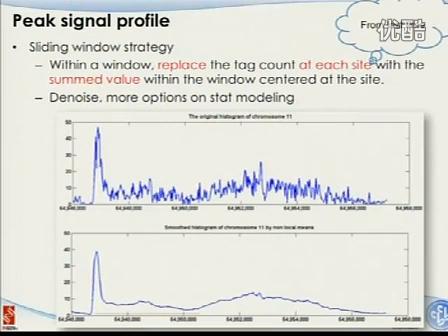Here is the one based on one base pair resolution, where the y-axis shows how many sequencing reads cover that particular region. You can see this is a very spiky type of profile.